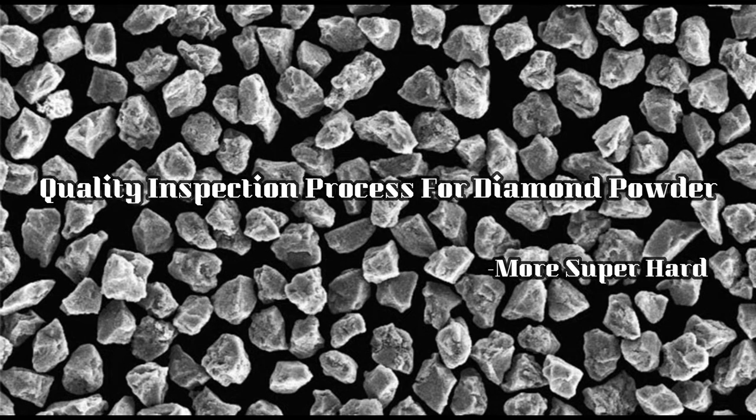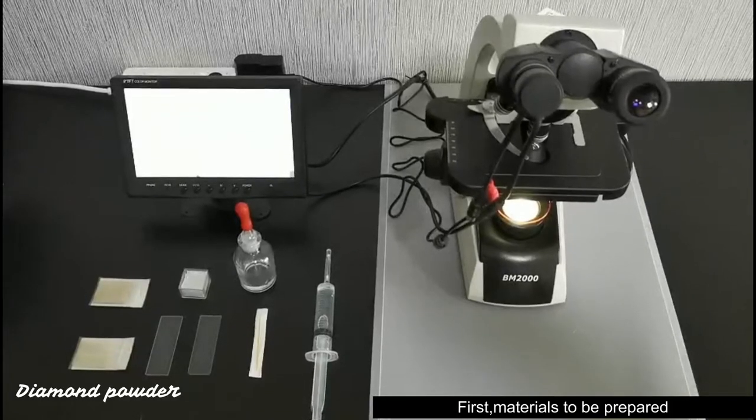Hello, today we are going to show our quality inspection process for diamond powder. First, materials to be prepared.